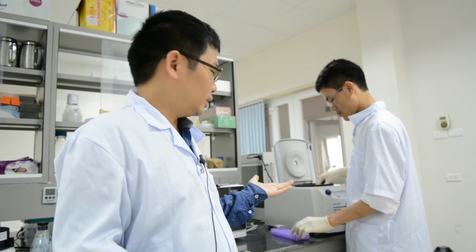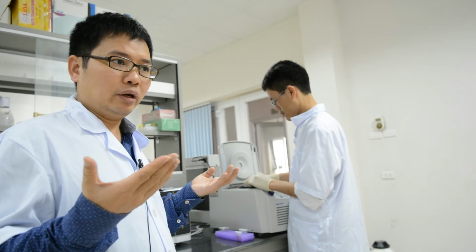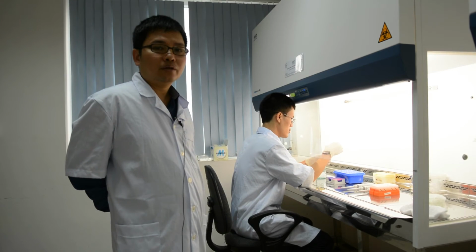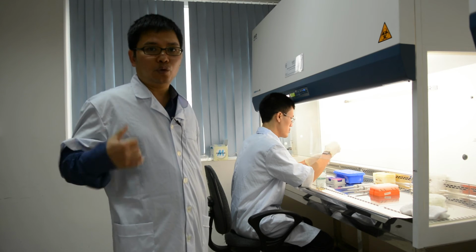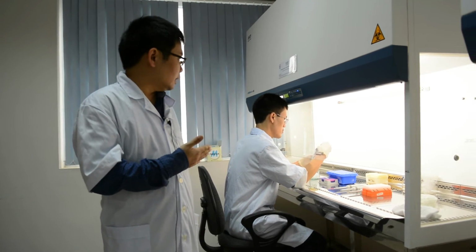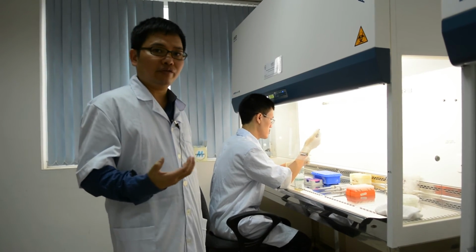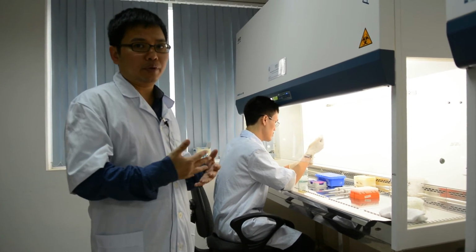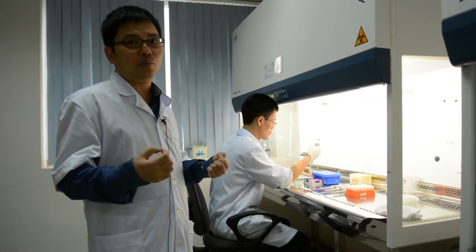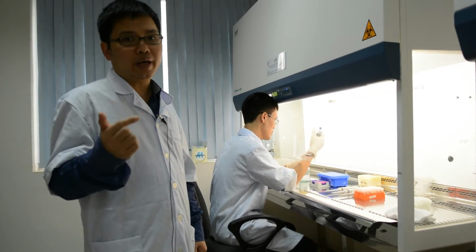First, after collecting the sample from the field, you need to extract the DNA using a special method, and in this extraction you have to ensure that no contamination or impurity is present. After you get the purified DNA, the next step is setting up the reaction. Because LAMP is very sensitive, you need to be very careful when setting up a reaction. In order for LAMP to work, we need a special enzyme, which we call Bst polymerase.